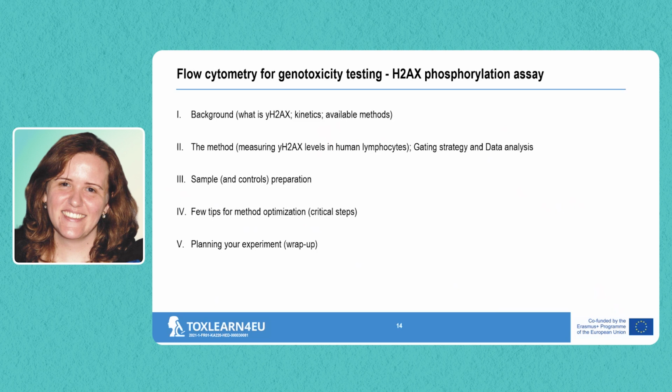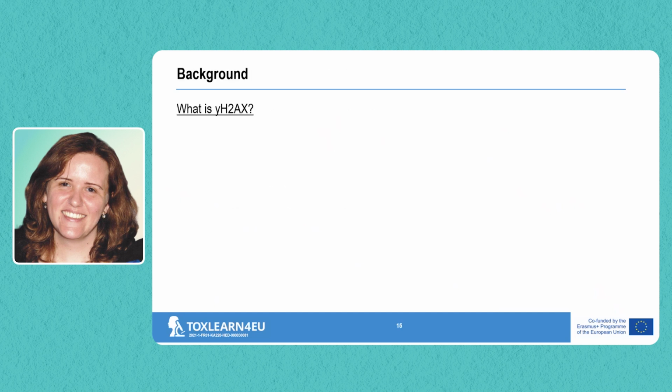What is H2AX, the kinetics, the available methods, then the method itself, the gating strategy and the data analysis, then sample and controls preparation, then a few tips for method optimization and how to plan your experiment.